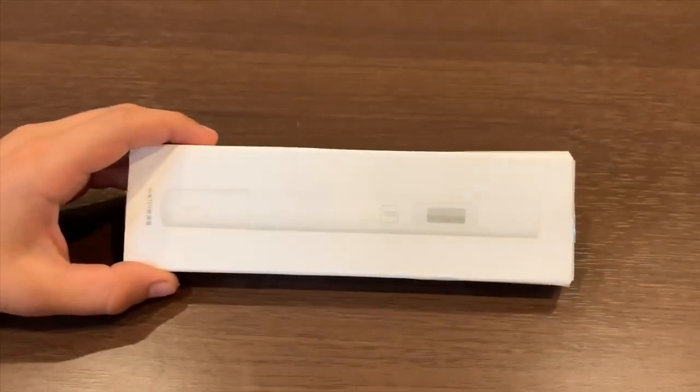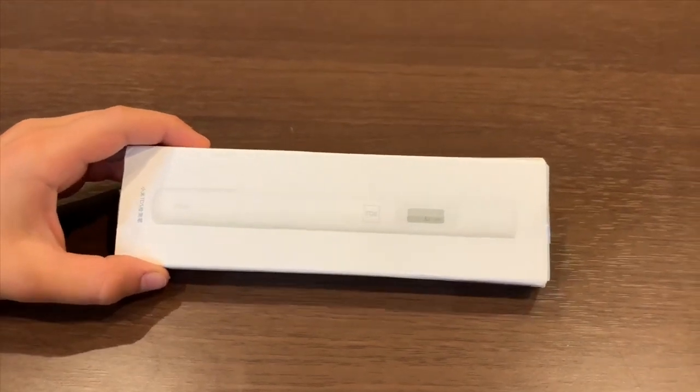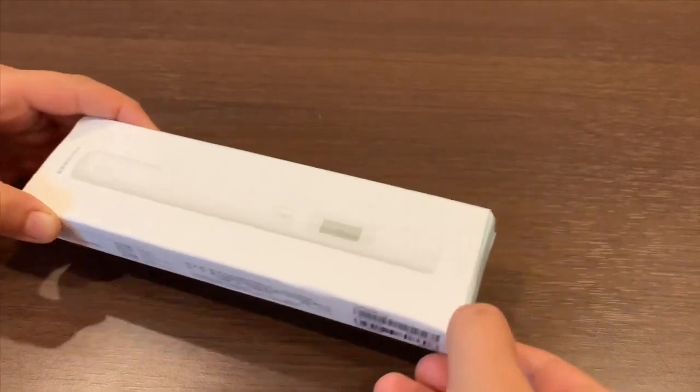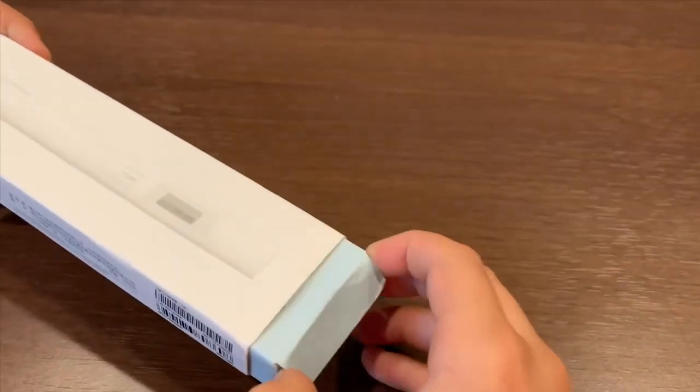This is a TDS test device. We're going to use this to figure out what the TDS level is. For more information, check the link down below.